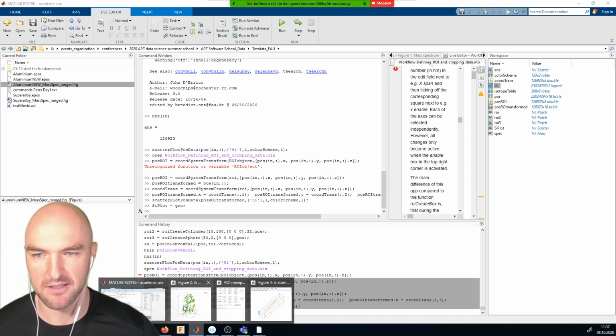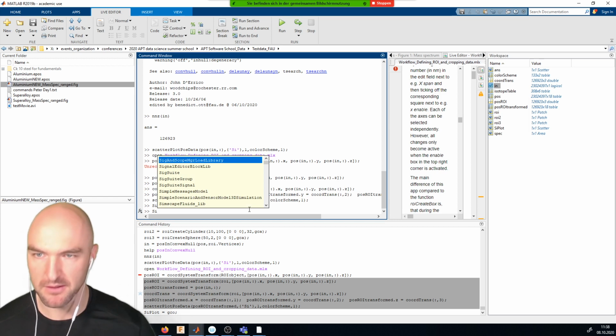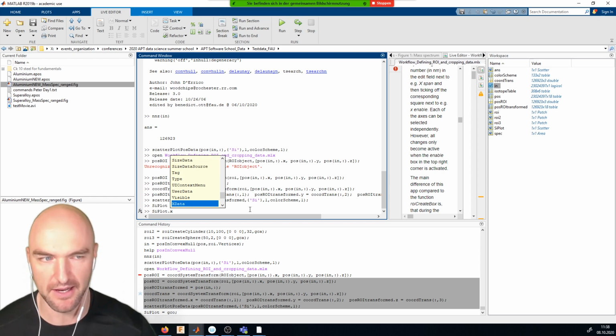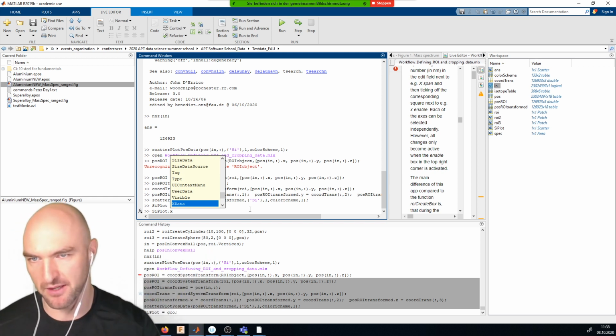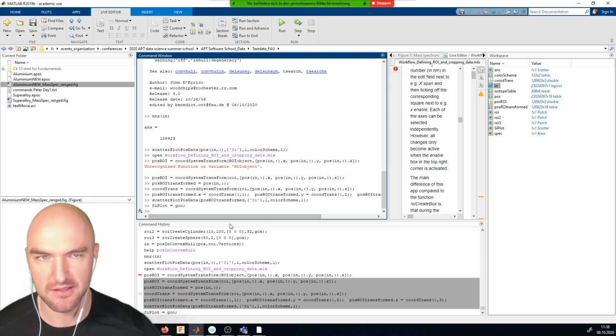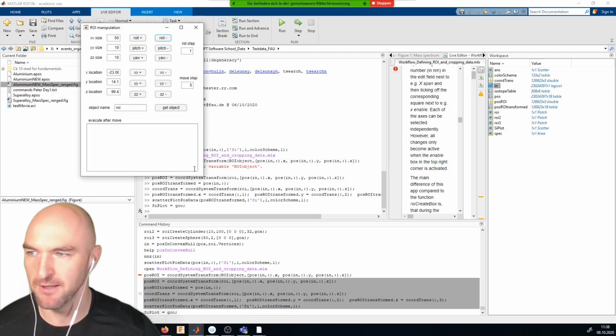And what we want to do is that every time we move our region of interest using the ROI manipulate app, we want this also to update in the silicon map here. So what we are going to do is assign those updated coordinates to that scatter plot. That scatter plot does have X data, Y data, and Z data. And we can override that with the updated coordinates. Okay? And so what we are going to do is take some of that code from here.